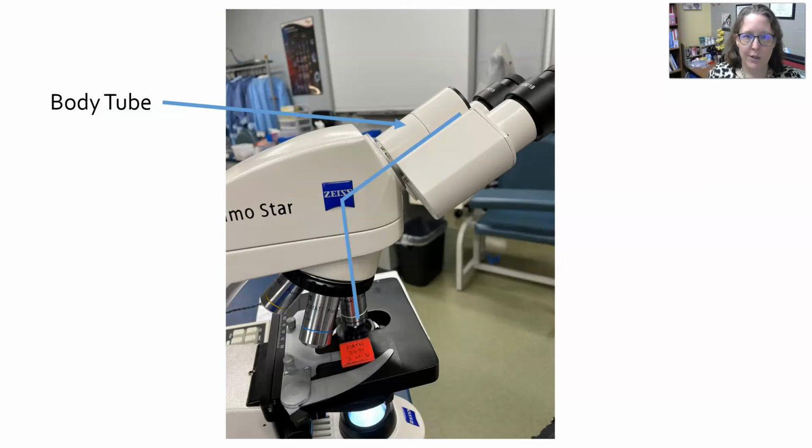And so what you have to know is that there is a mirror here. The light comes here from the light source, goes through the condenser, through the specimen, straight through the objective, all the way in, and then it bends here. There's a mirror, and it goes through the body tube, and then that's what you see.